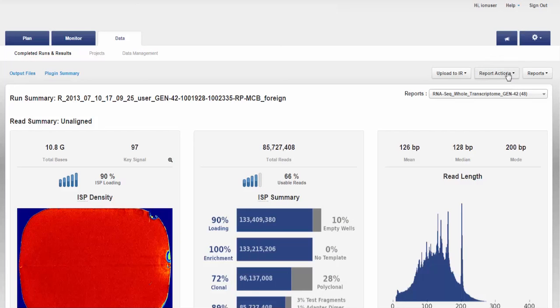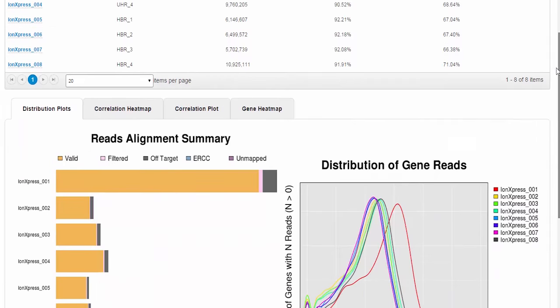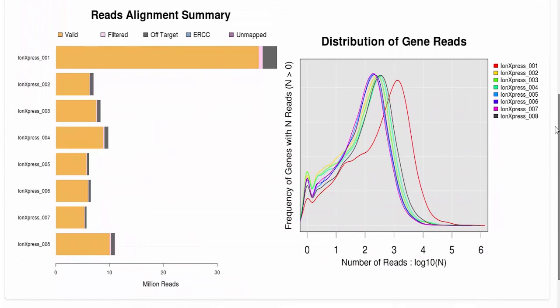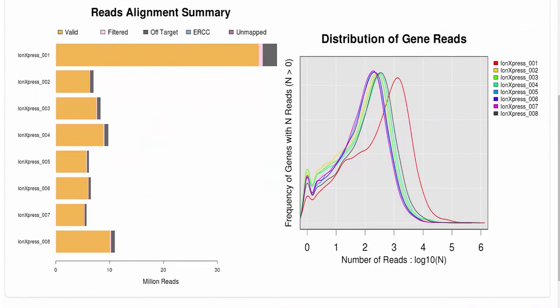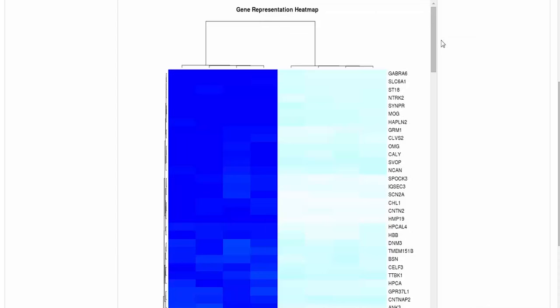For targeted RNA sequencing, analysis is much more straightforward. Data is analyzed using a provided software plugin available in Torrent Suite software, and gene expression values are provided as well as clustering of genes that exhibit different patterns of expression. The expression data can be used in a variety of standard software packages for further statistical analysis if desired.